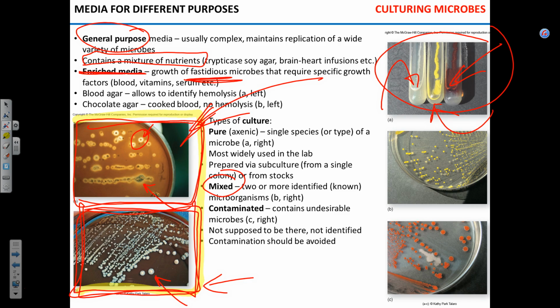Okay? One thing, by the way, word of warning, if you think about sampling the bottom of your shoe, I strongly suggest against it. It is gross, but you won't be able to isolate any species because it's going to be like a lawn. It's like bacteria covered with fungus. Seriously, there's no isolation. I mean, find something less dirty, like urinal. I'm not kidding.